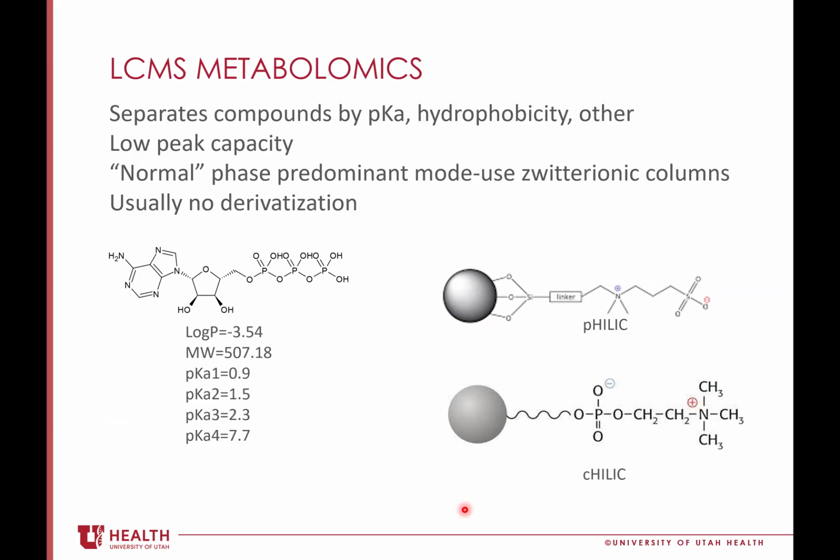Anyway, I was just thinking of something like an ion trap, where instead of doing the pre-sorting, could you do a voltage-dependent fragmentation of the molecule that then tells you something about the stereochemistry and the structure, even if it is at the same molecular weight? We do that occasionally, but the problem is when you start fragmenting like that, you start losing sensitivity. With an ion trap, going from MS1 to MS2 to MS3 to separate those things is certainly a possibility, but you really start losing sensitivity by like 1,000-fold. Wow. Okay.